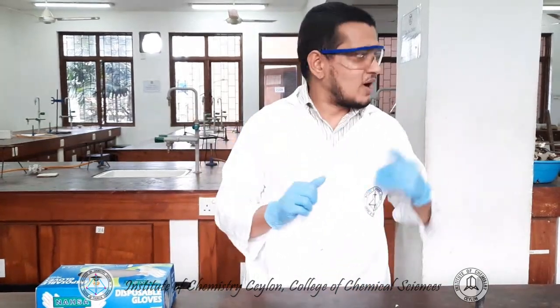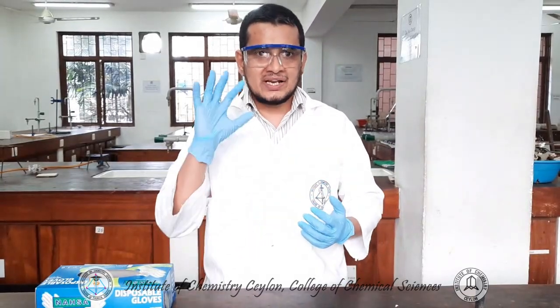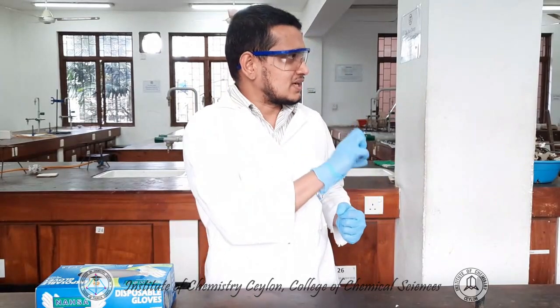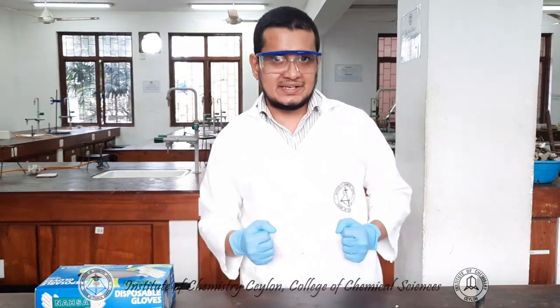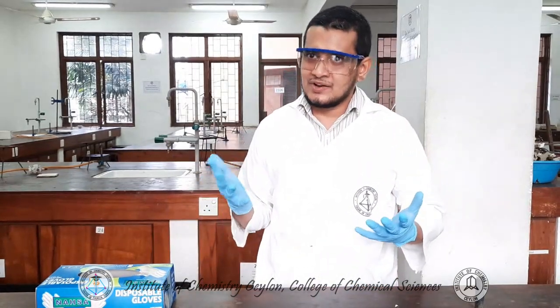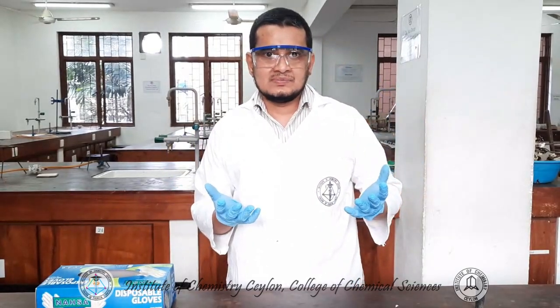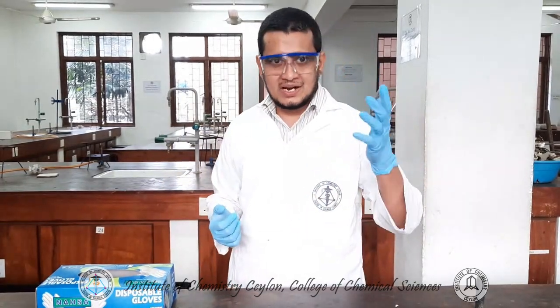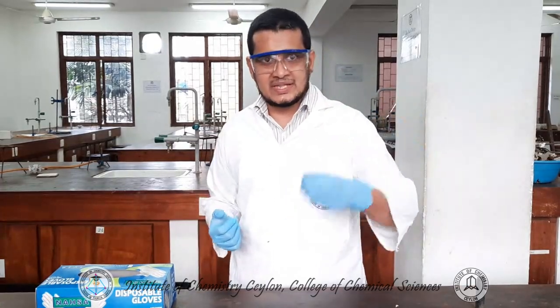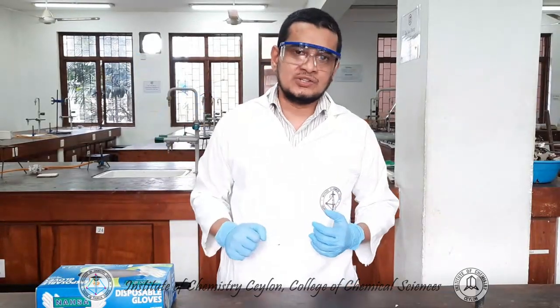Inside the lab, you have to be unselfish. So when you go outside the lab, try to remove your gloves, and with the gloves on, do not touch fridge handles, doorknobs and railings, surfaces like that. Now in that case, if you are required to go out and centrifuge your samples, then sometimes maybe you have to wear one glove, where you touch the chemical with that hand, and to doorknobs you will be using your free hand.